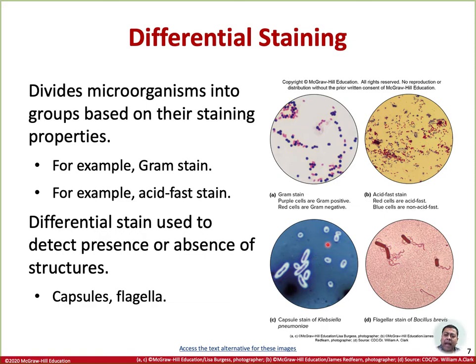So the background is stained by an acidic dye. I'm going slow here. The background is a glass slide which is stained by an acidic dye, which has negative charges. The glass slide is inherently positively charged. So the acidic dye, which has negative charges, is attracted to the glass slide, and thus the dye binds to the glass slide. So the glass slide becomes this uniform blackish gray color. This is what is called a negative stain.